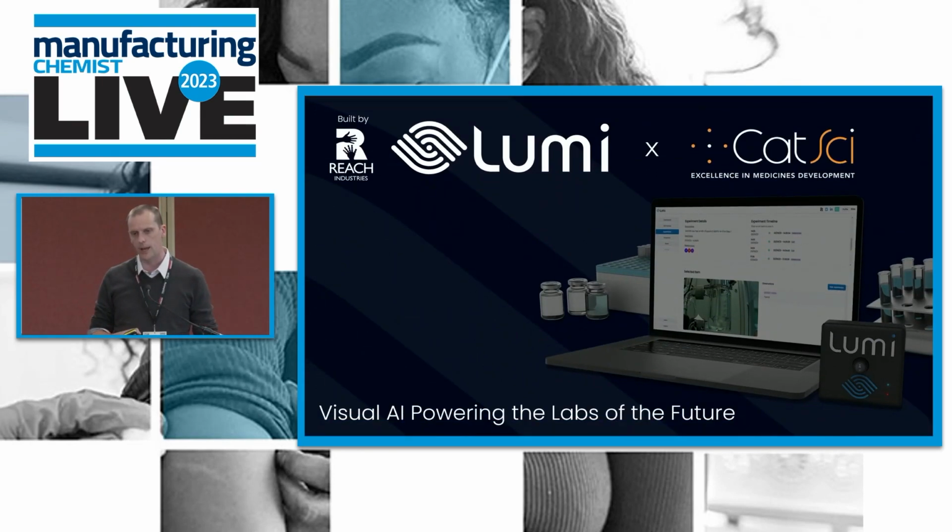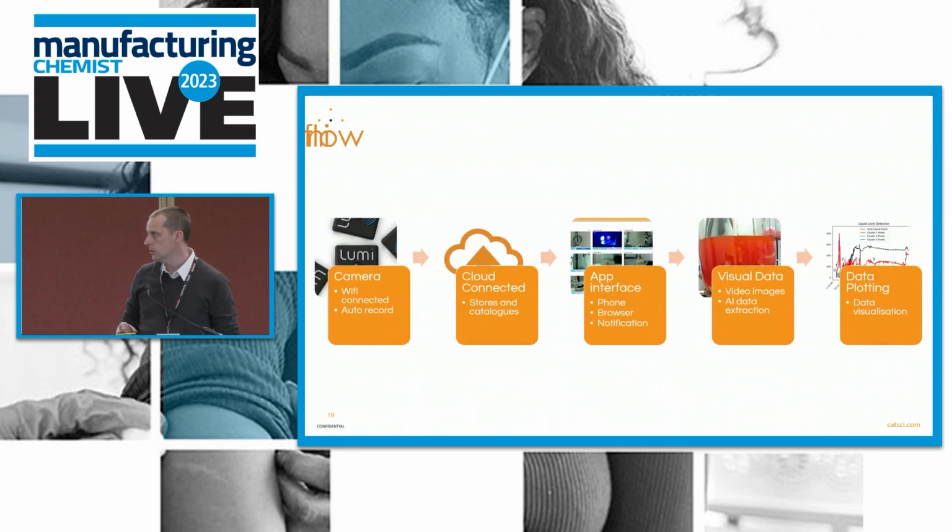Well, we're working with a Bristol-based startup. The company's called Reach Industries, but they have a product called Lumi, which is this little camera here at the bottom. So it's a very small webcam, essentially, which is connected to the cloud and then has some AI in a portal behind. So I'll talk about some use cases for them.